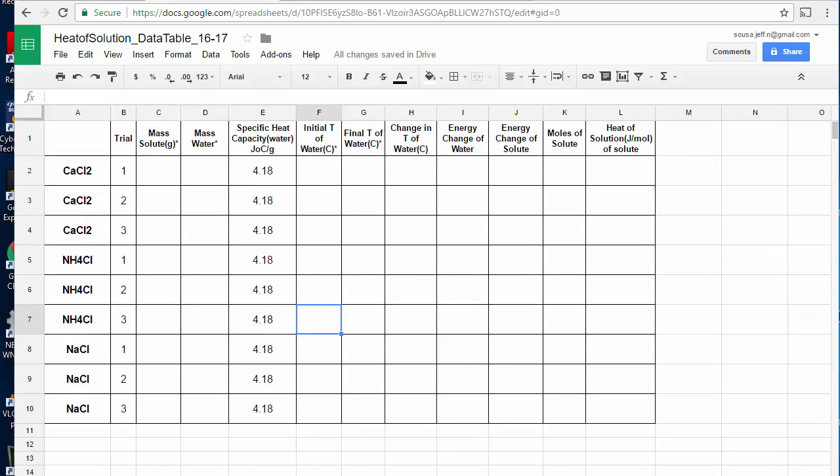All right, so you should have paused the video and you should have something like what I have in front of me. Again, this is very black and white. It's very complicated for me to kind of see what I'm supposed to be using here and where I'm supposed to be filling things in. So I'm going to do some things to pretty it up.